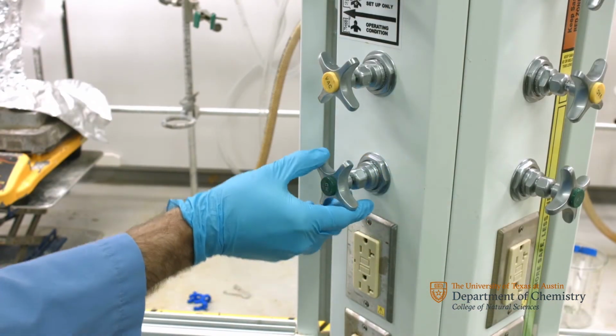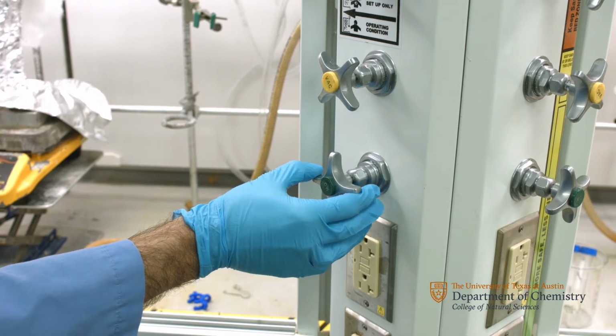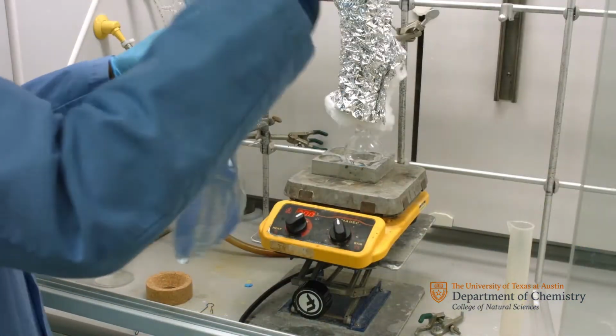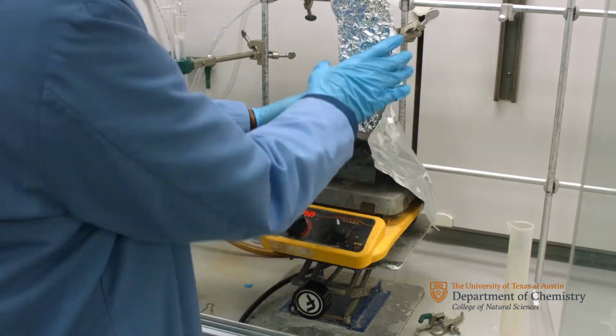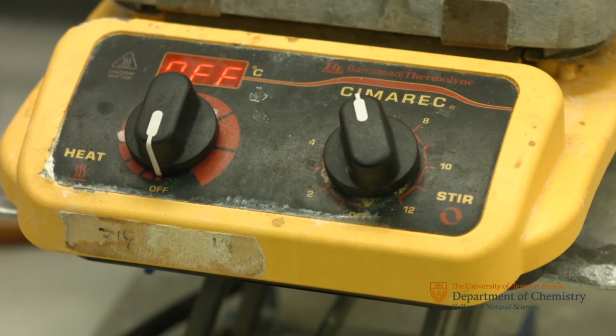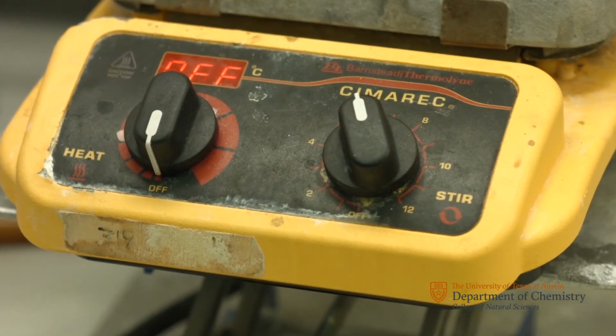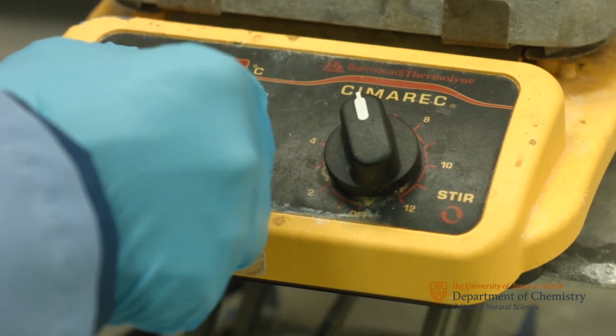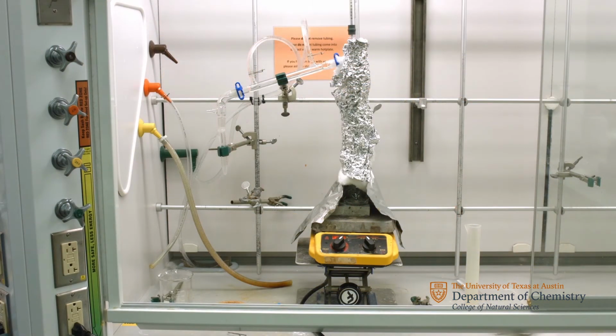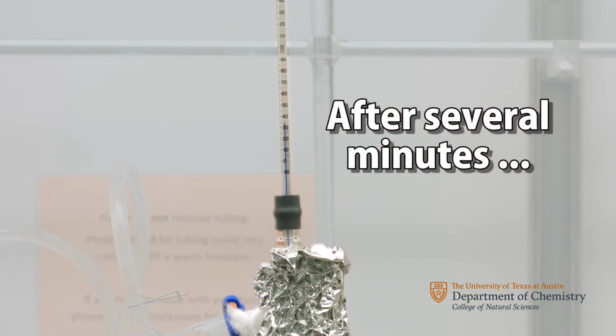Slowly turn on the water so that it flows, filling up the condenser. Wrap some aluminum foil around the distillation flask and the hot plate. Turn on the stir plate so that the stir bar is spinning gently. Turn on the hot plate to the setting as directed by your TA. After several minutes, you'll notice the temperature start to rise, and at some point, it will plateau.